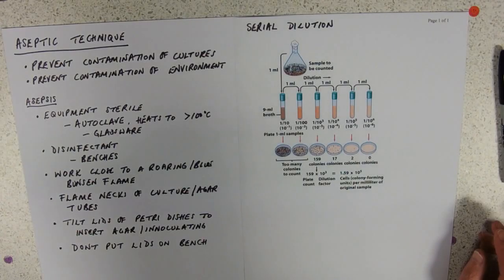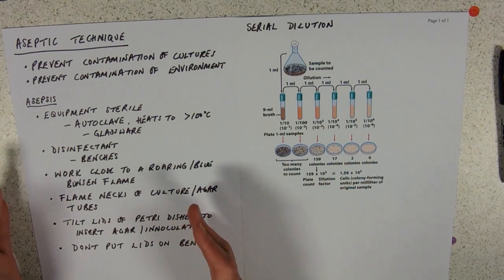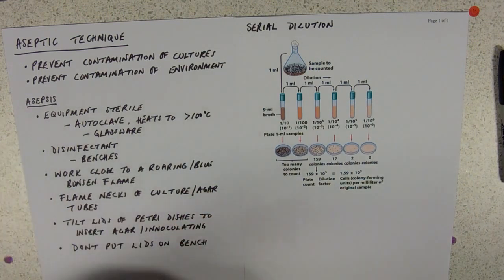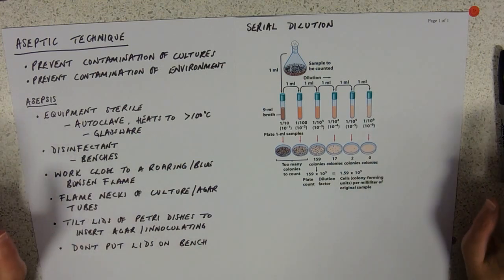Okay, let's deal with the knotty problem of serial dilution. I've left my aseptic technique stuff over here because we're going to use aseptic technique throughout, so we need to remember those things. So why do we use serial dilution?